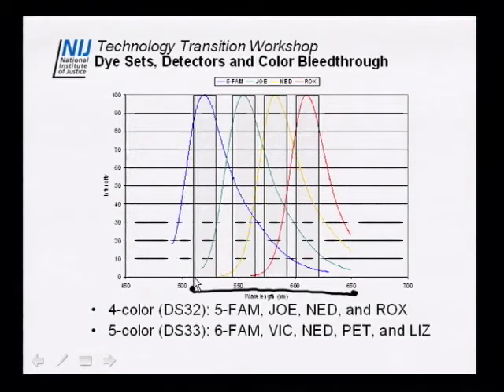Your laser excitation is somewhere between 488 nanometers and 514. So you'll have peaks that are here that are really associated with your laser. So for detection, you want to make sure that you only detect within the visible window of around 520 to 650. If you look at the spectra for each of the dyes, so take for example 5-FAM, this one here, you see that it's actually relatively broad.